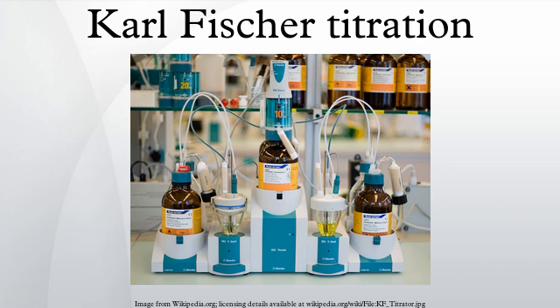Advantages of analysis: the popularity of the Karl Fischer titration is due in large part to several practical advantages that it holds over other methods of moisture determination, including high accuracy and precision, typically within 1% of available water, for example 3.00% appears as 2.97 to 3.03%.